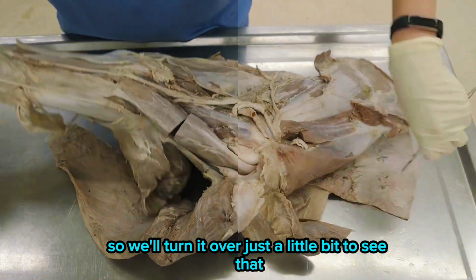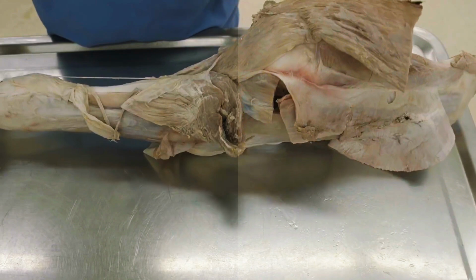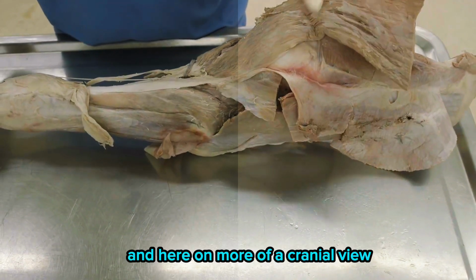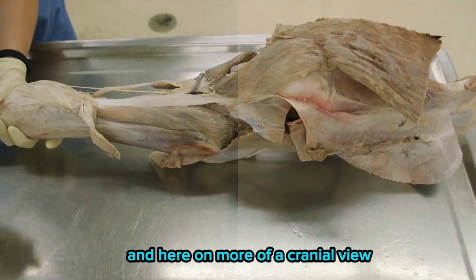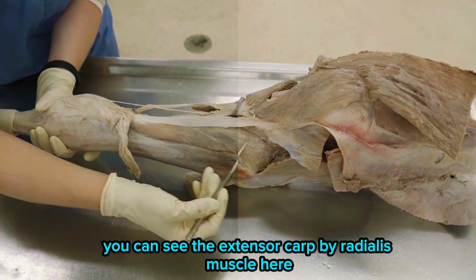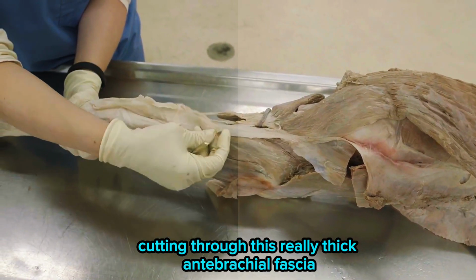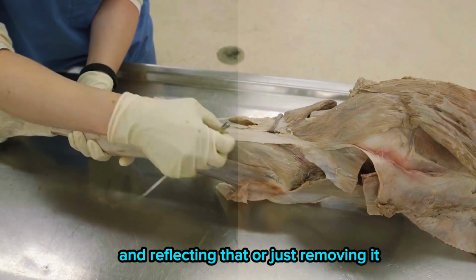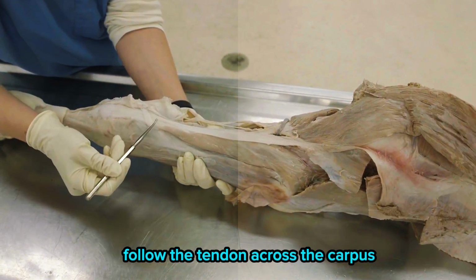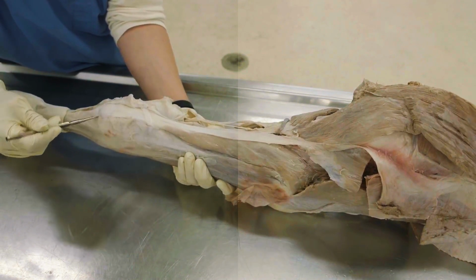So we'll turn it over just a little bit to see that, extensor carpi radialis. So we'll flip those pectorals out of the way again. And here, on more of a cranial view, you can see the extensor carpi radialis muscle here. And you'll want to follow that, again, cutting through this really thick antebrachial fascia and reflecting that, or just removing it. So here, extensor carpi radialis muscle coming down, follow the tendon across the carpus to where it inserts proximally on the cannon bone.